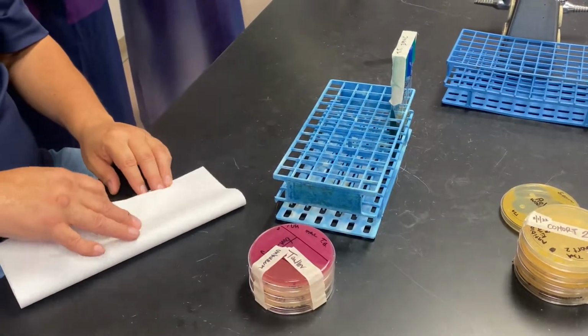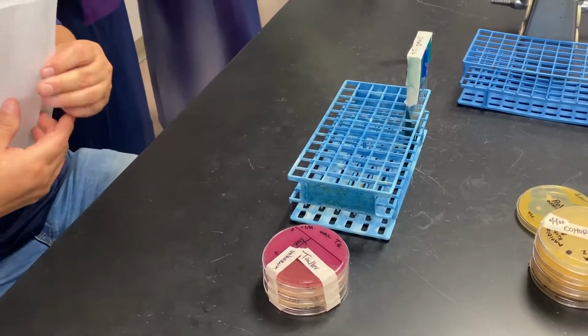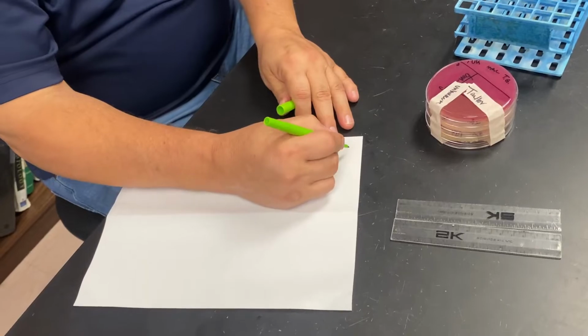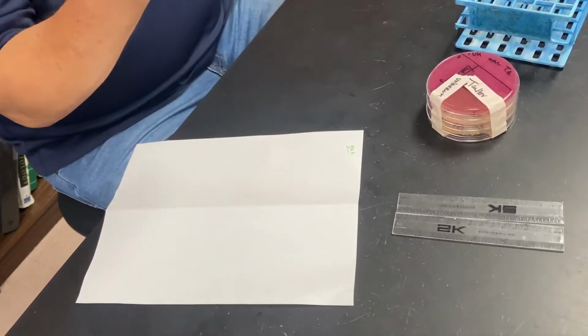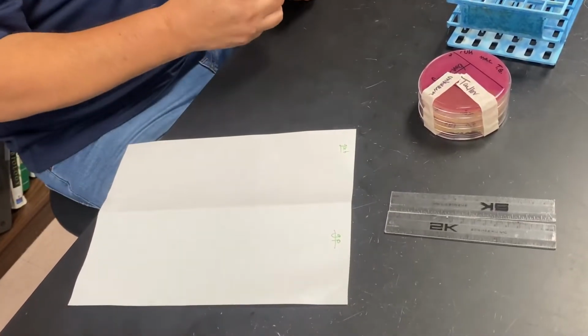What I'd like for you to do is take a piece of paper and fold it in half. On one half, write gram-negative bacillus, because you know it's a gram-negative bacillus, and the other one is going to be a gram-positive something, but you don't know what yet.